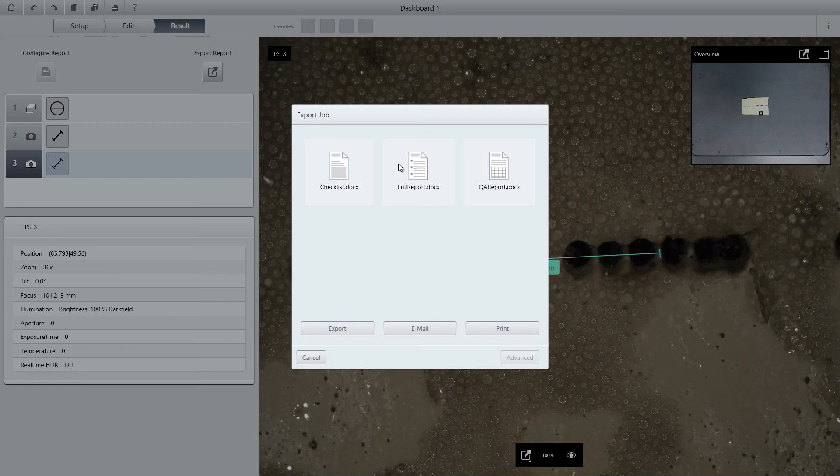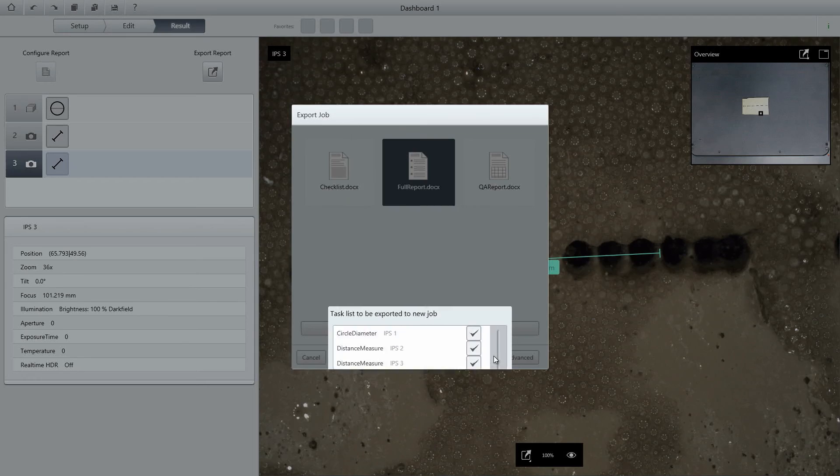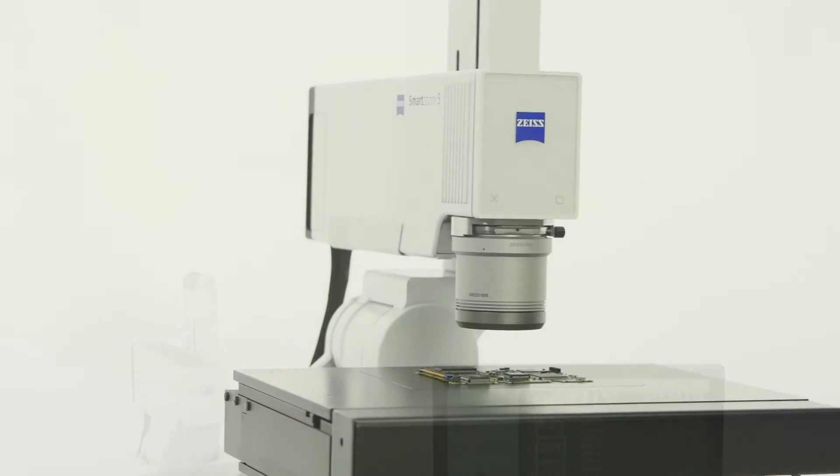Create inspection reports with just one click. ZEISS SmartZoom 5 makes it simple and efficient to create quality control plans for reproducible inspection of all identical samples.